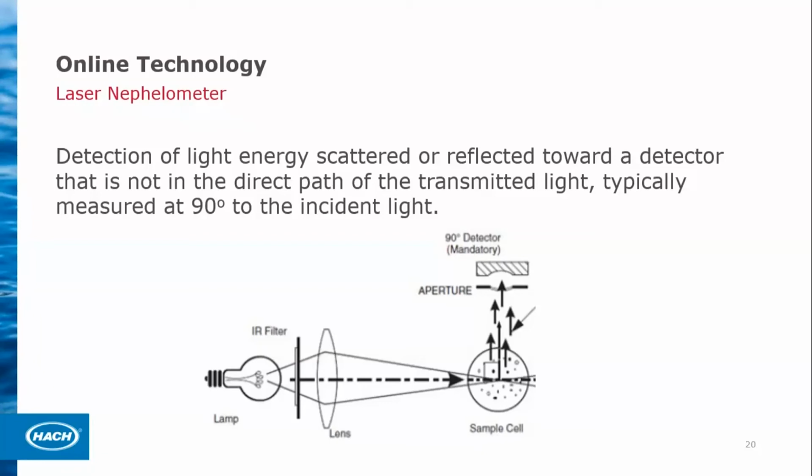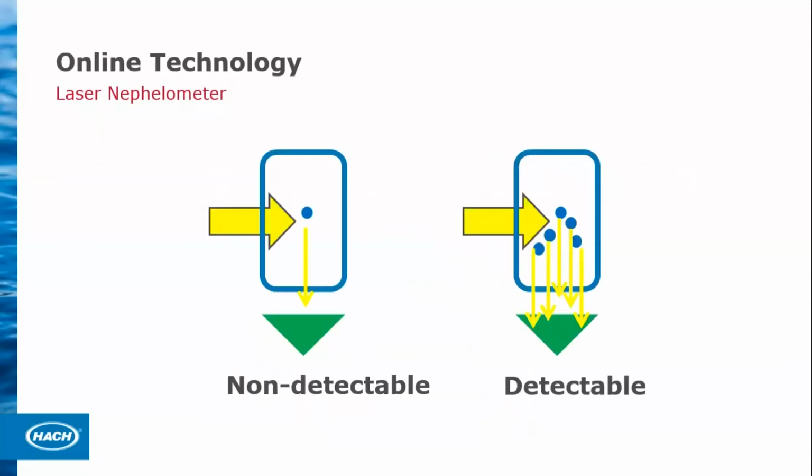monitoring a corrosion product. The downfall is a couple of things. One, it generally cannot see particles below 2 microns in size, whereas the laser nephelometer can see down to submicron particles. So first of all, the particle counter is probably missing some of it. The other thing is, I don't know if studies have been done to indicate the linearity. I'm going to show you here the linearity of the laser nephelometer when making iron measurements. That's very important if we're going to try to quantify it.